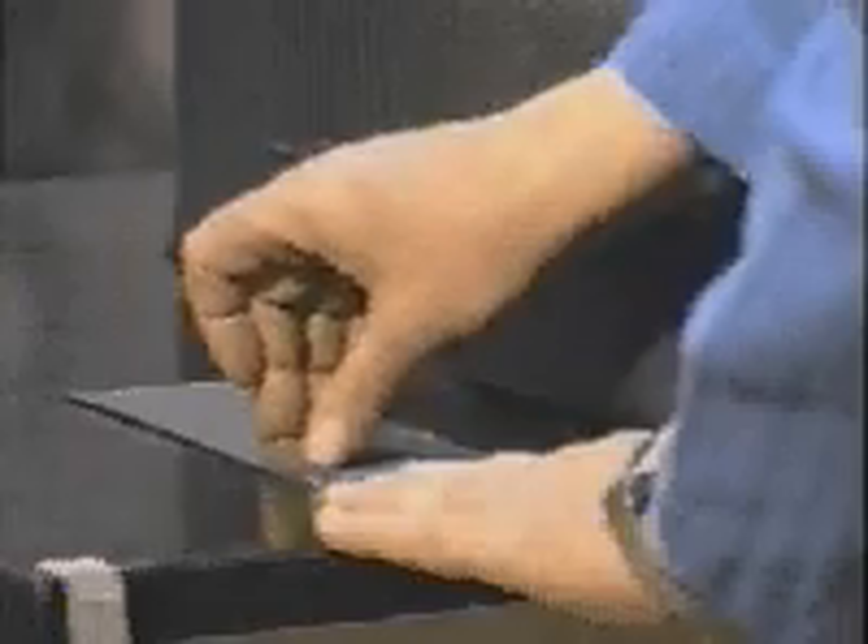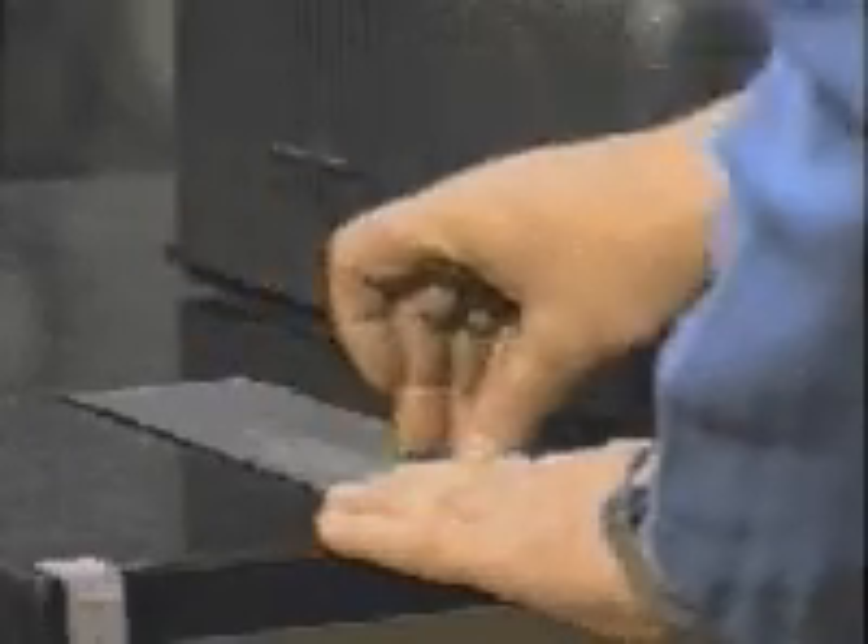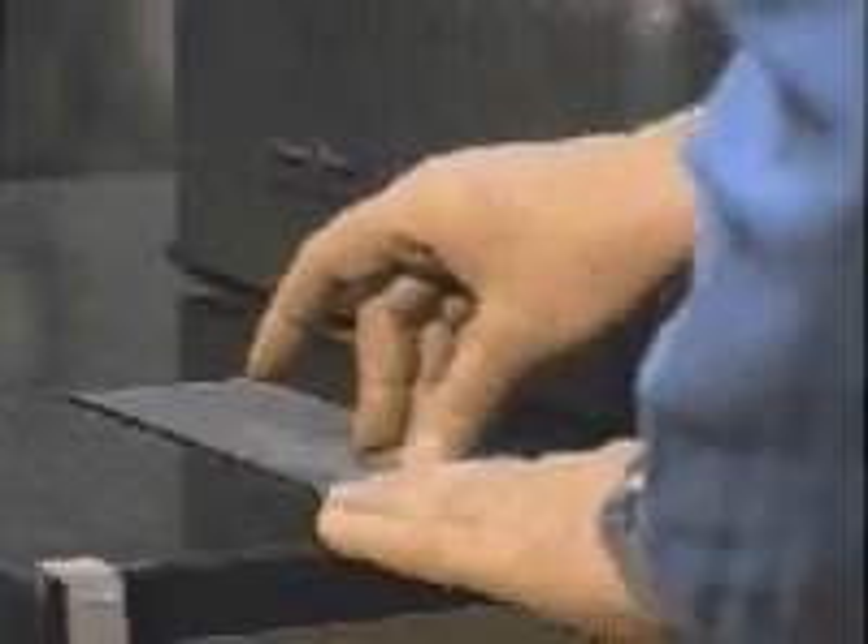Take the test specimen and remove any edge burrs by lightly sanding on emery cloth. Support the test specimen on the anvil.